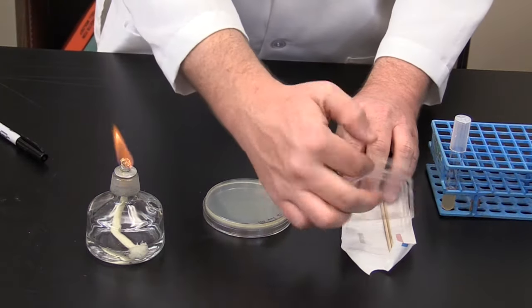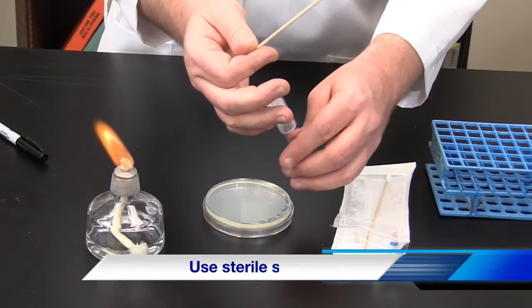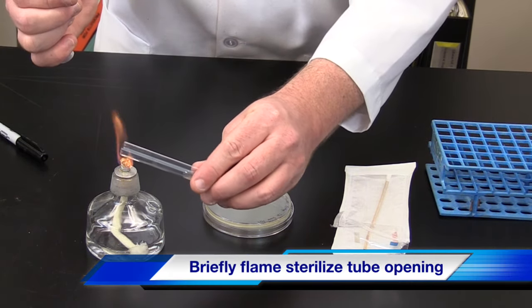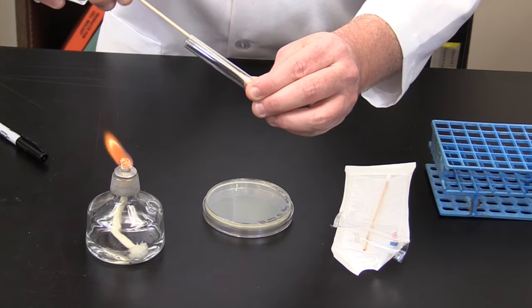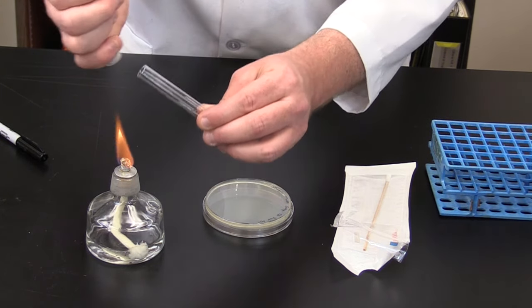Next, we're going to use a sterile swab to inoculate the plate. Grab the test tube, remove the cap, and gently flame sterilize. Dip the swab into the bacterial broth, remove from the tube, and gently flame sterilize. Recap the tube.